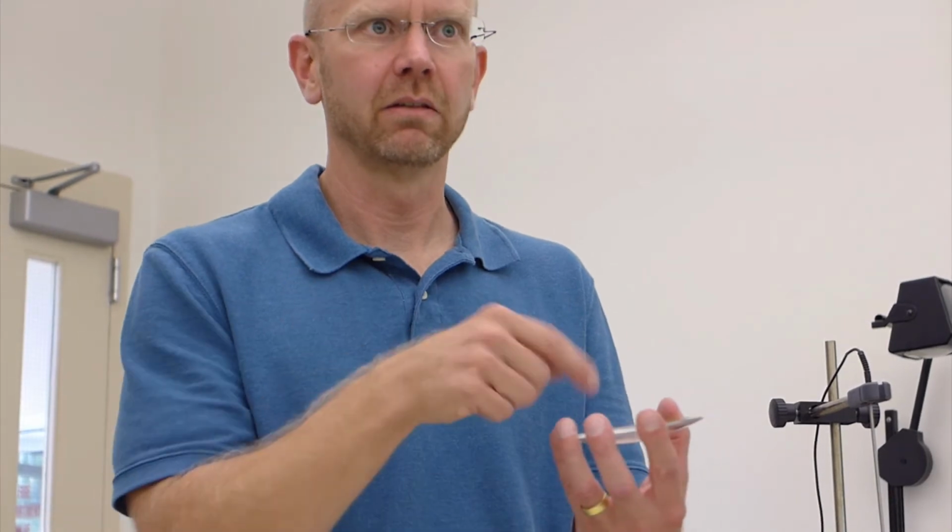We have lots of solvents in the stockroom. And so, if you get a solid after your reaction mixture cools, you can take some of that solid and test different potential solvents. Ethanol and methanol are really good recrystallization solvents for a lot of organic molecules because they're fairly polar, and the non-polar organic molecules are sometimes insoluble at room temperature, but as you warm them up, they become soluble. So those are good choices, and toluene is available, which has a very different set of intermolecular forces that it uses to dissolve compounds, right? Ethyl acetate, acetone can be used for some compounds.